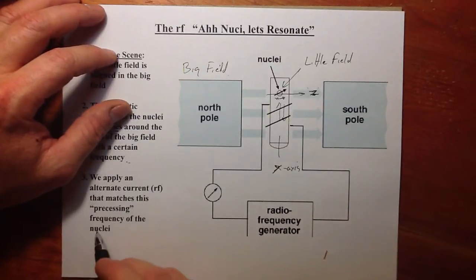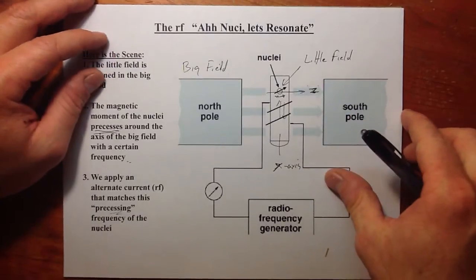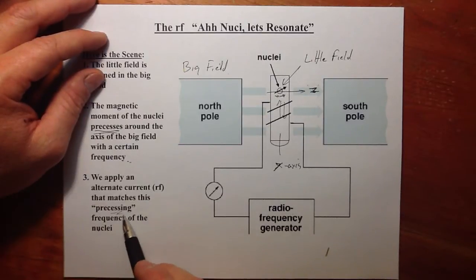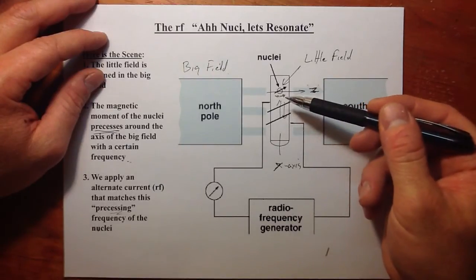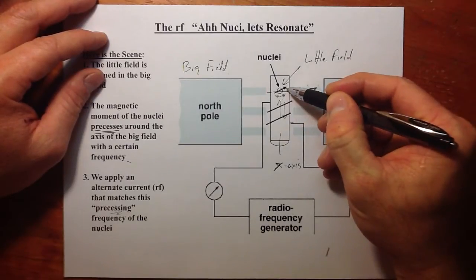So once we hit the precession frequency, as soon as we match that, we can get a flipping of that little field. So we apply an alternating current. That's our radio frequency that matches this precessing. Now, of course, this is in just one dimension. The precession is in two dimensions, but we can still match that frequency of precession as this arrow is going up.